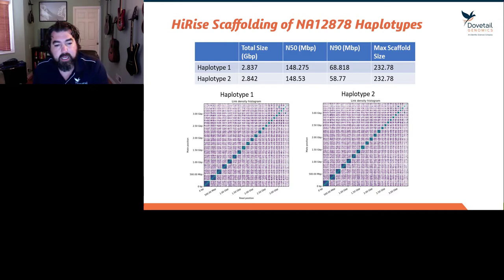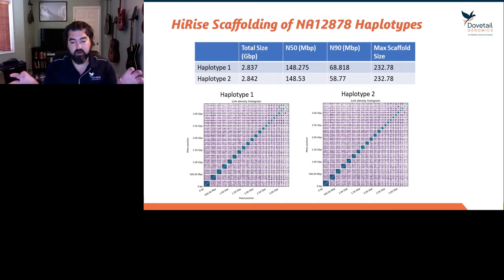long-read data, and you have this proximity ligation Omni-C data, you can pre-phase your long-range reads into 2 buckets and build haplotype assemblies from scratch, which is what we've done here with GM12878, where we've taken, again, the PacBio data, aligned our Omni-C reads to them, and then created 2 haplotype buckets of PacBio reads, and then generated and scaffolded assemblies for each haplotype de novo.